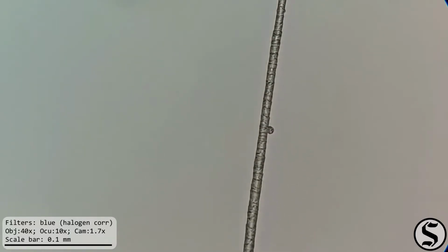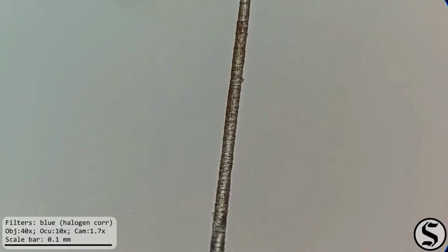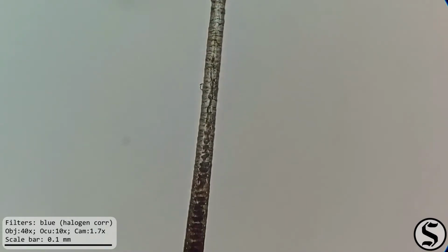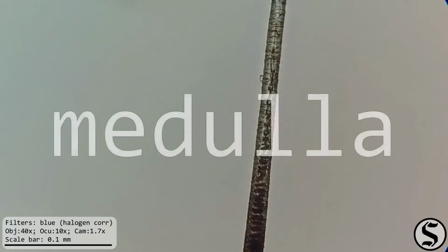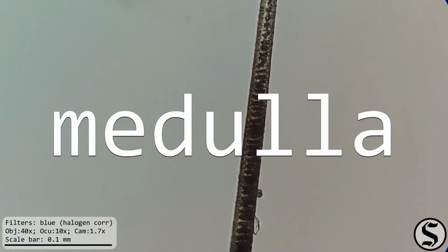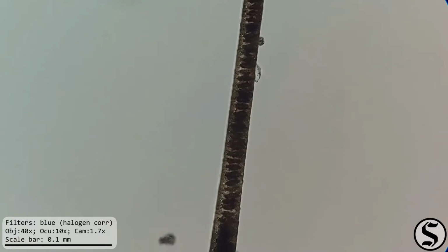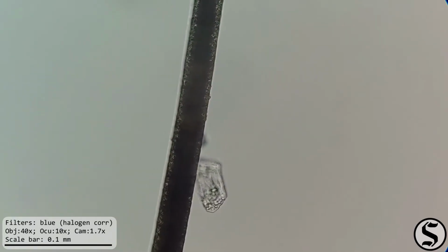And as we pan downwards, we can see it has a very long taper. And this right here, this is the real giveaway for me. This is the medulla of the hair. Medulla comes from the Latin word for bone marrow or plant pith. And if you watched my previous videos on hair, then I think you will immediately recognize that as a cat hair, because we have one of those and it gets hair everywhere.